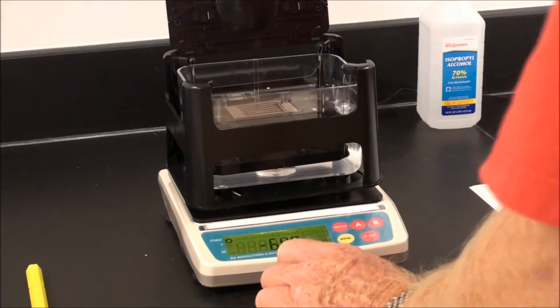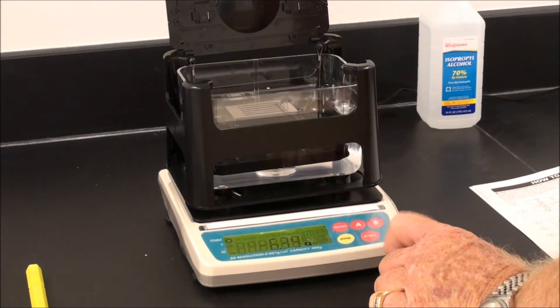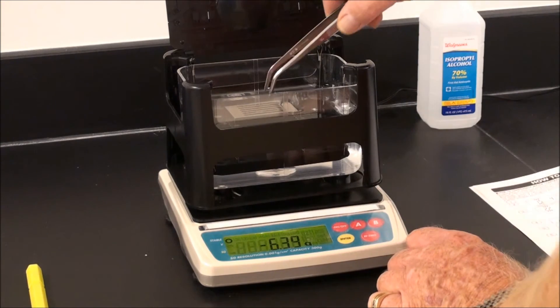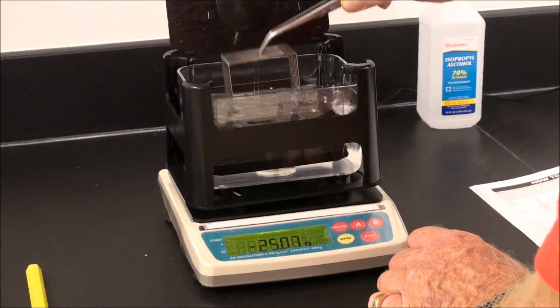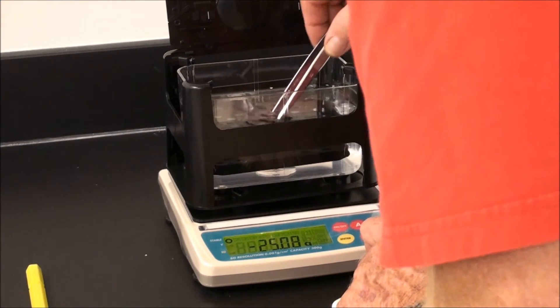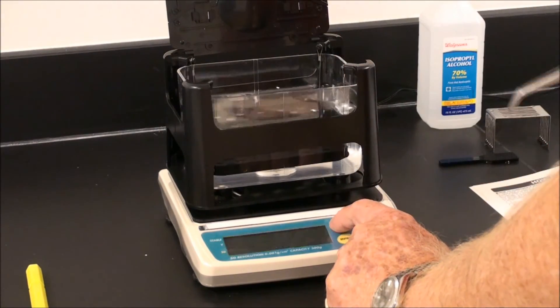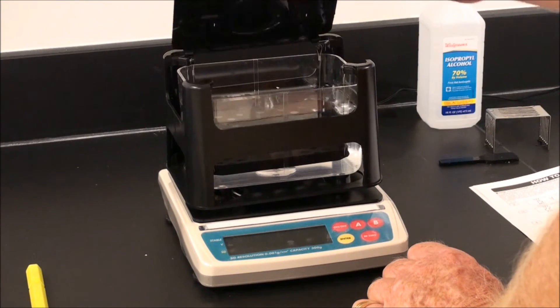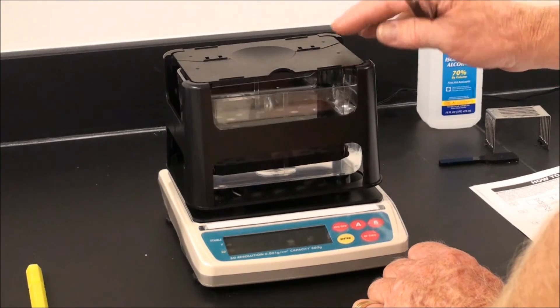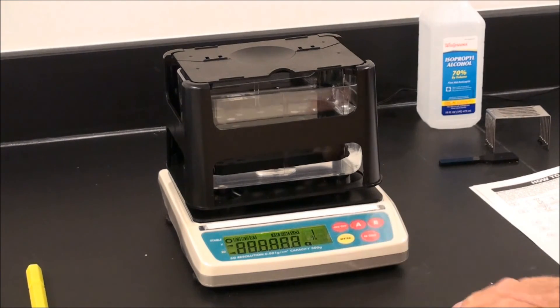We are now ready to start again and re-zero the system. At any time, if you need to re-zero the system without the compensated weight, simply turn the power off. Close the lid, allow all vibration to cease, then turn back on and wait for stabilization. The stability mark will appear and we are ready to go.